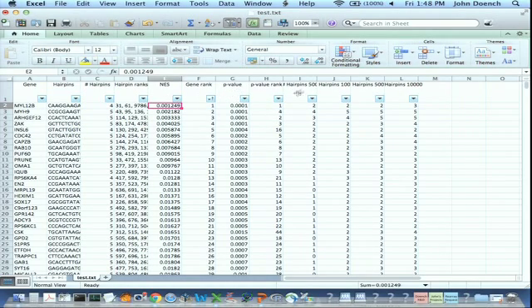But you also get these other fields. These are just descriptive fields. They might or might not be meaningful based on your screen. So there's the number of hairpins that scored in the top 500, the number in the top 1,000, the number in the top 5,000, etc. Sometimes that's meaningful, sometimes it's not, but it's just a report that comes with it for free. To be honest, when analyzing screens, I never really use these fields to decide anything, but they're there for your enjoyment.